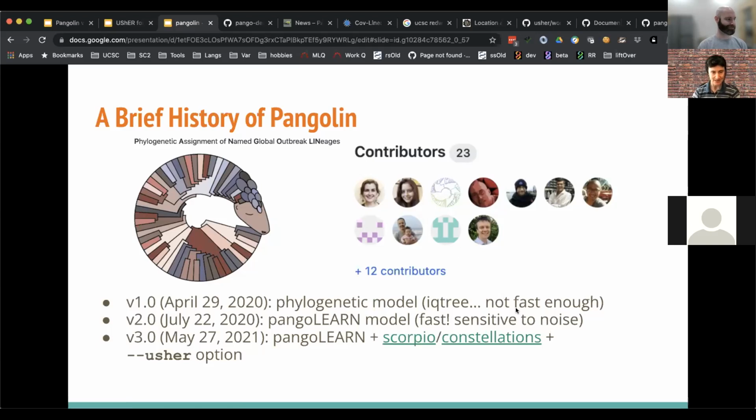I feel that it's a little sensitive to noise in the sequences. If there are Ns, ambiguous bases make it tough for any tool to really place a sequence phylogenetically. But I think some of the speed of this machine learning approach might come at a cost of accuracy.